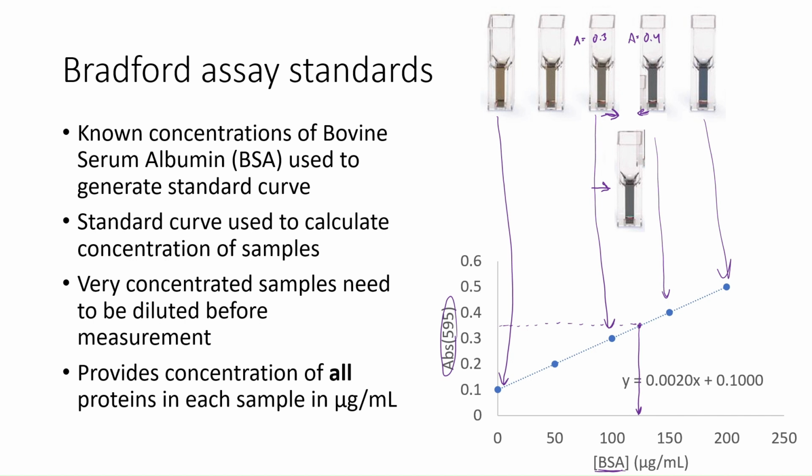And so sometimes what can happen is you'll have a sample that is very, very blue, much more blue than the highest standard that you created for your standard curve.